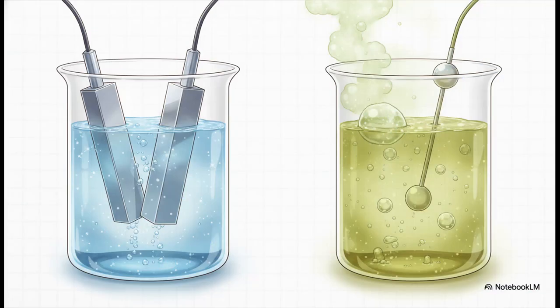But here's the thing. Having the right rings isn't quite enough. To get an accurate measurement, we have to match the physical geometry of the probe, which we call the cell constant, or K, to the expected conductivity of our liquid. The cell constant is just the ratio of the distance between the poles to their surface area.